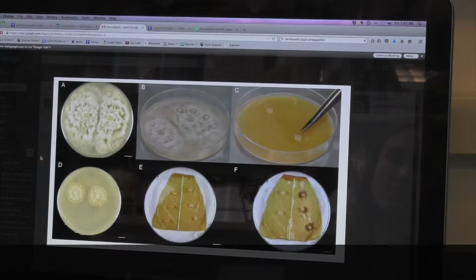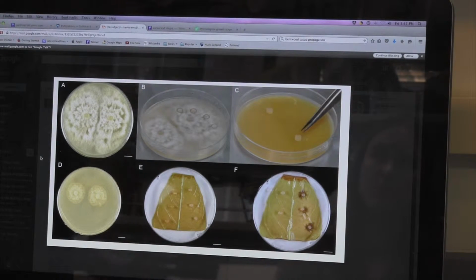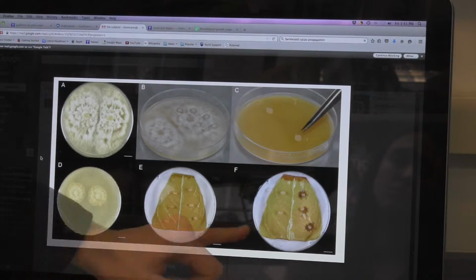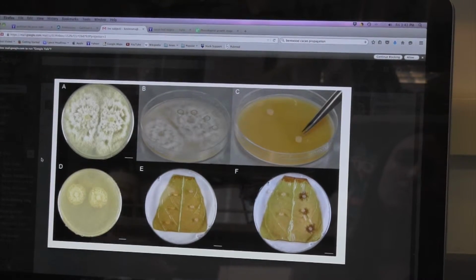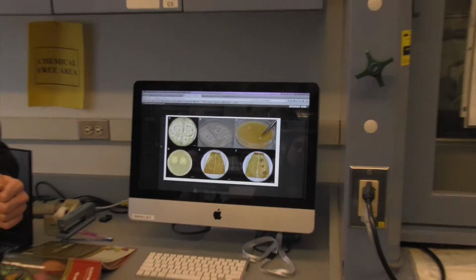And what he checks is how the different genes react to the fungus by using qPCR. So he's looking at the RNA production levels and things like that. He is able to see which genes are activated and which genes stay silenced, depending on the different types of pathogens that are introduced.